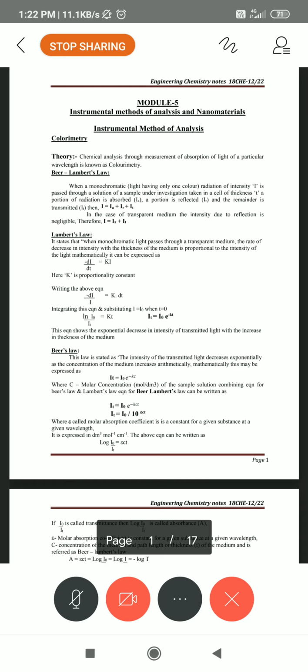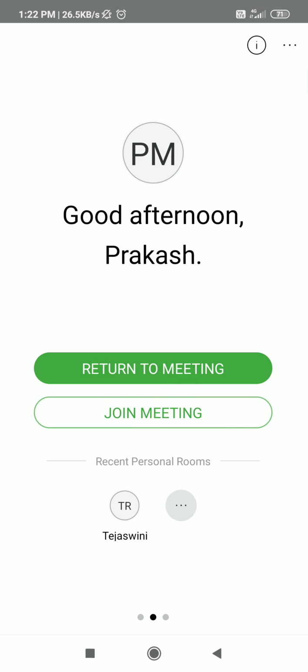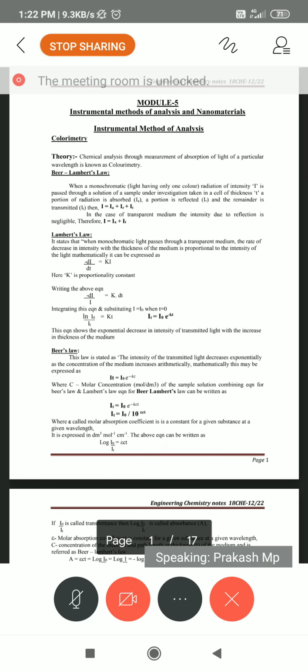You draw the two columns. In the first column, you can write 2 ml, 4 ml, 6 ml, 8 ml, 10 ml. So everything is going on. The last one you can label as test solution.